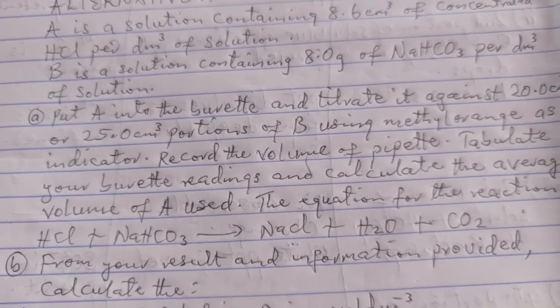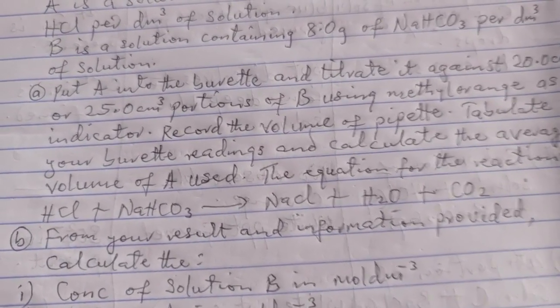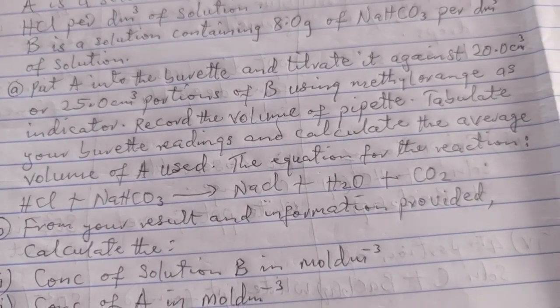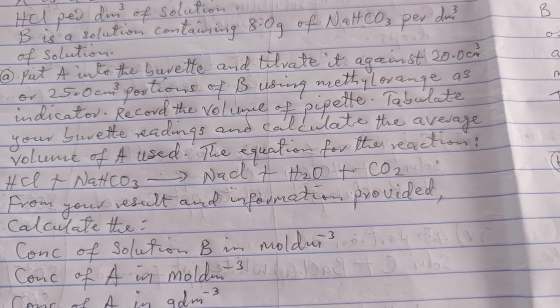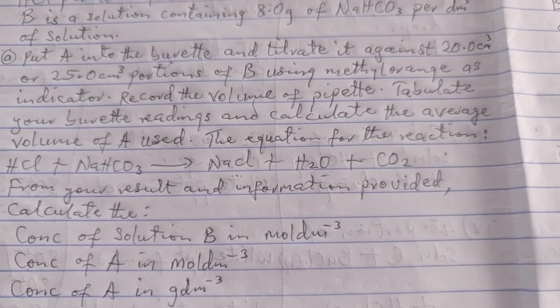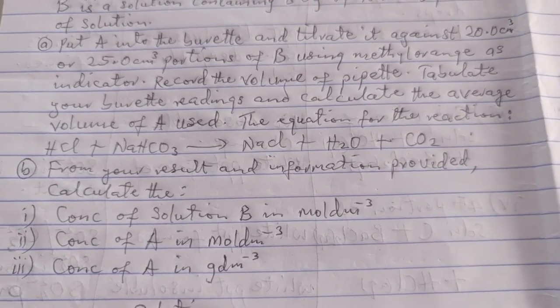A: Put A into a burette and titrate it against 20.0 cm³ or 25.0 cm³ portions of B using methyl orange as indicator. Record the volume of pipette, tabulate your burette readings, and calculate the average volume of A used.